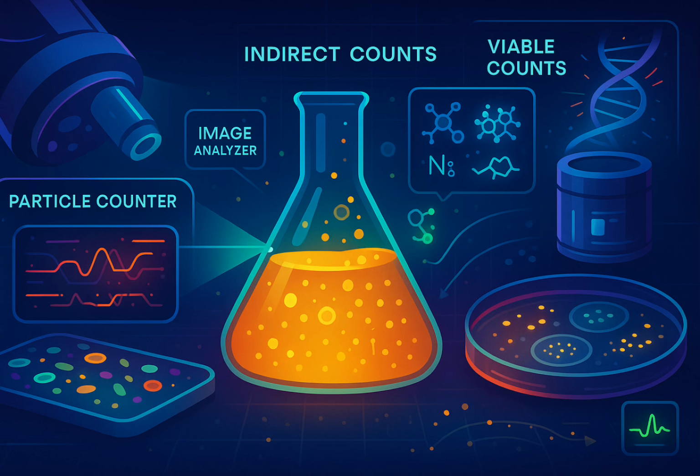Well, it works best for larger things. Yeasts, protozoa, bigger bacteria. Maybe many bacteria are right on the edge of its detection limit. Yeah. And the big one, it counts any particle of the right size. It can't easily tell a bacterial cell from, say, a tiny bit of plastic or dust if it's the same size. So not great for dirty samples. Not without pre-treatment, no. And yeah, they're expensive machines.